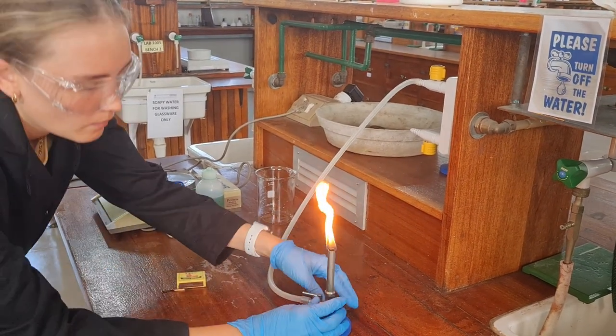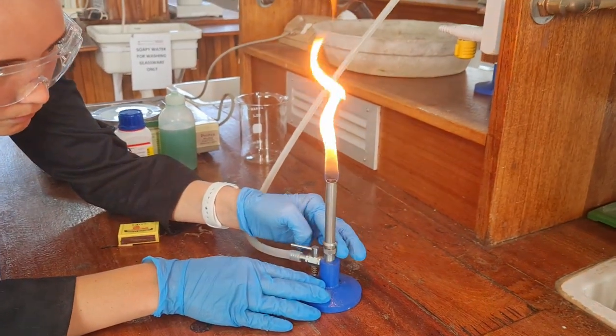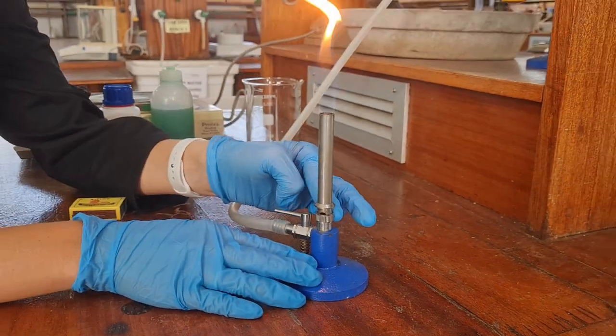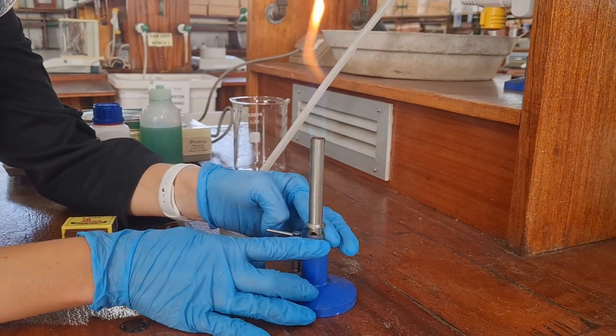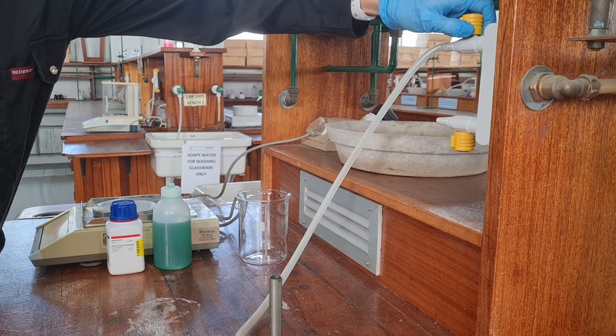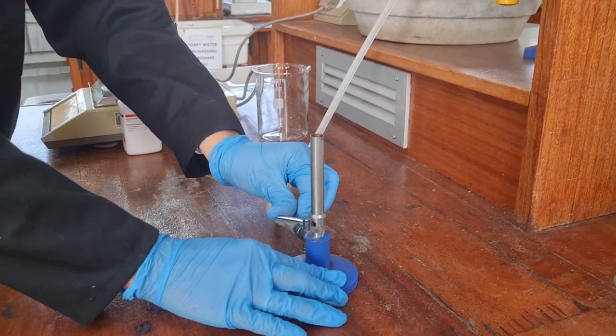Remember to blow out your match. The burner will be lit now and have an orange type flame. Use the collar to close or open the air hole until a bluish flame appears. Once done, close the gas tap and if the burner has a side lever, remember to close that as well.